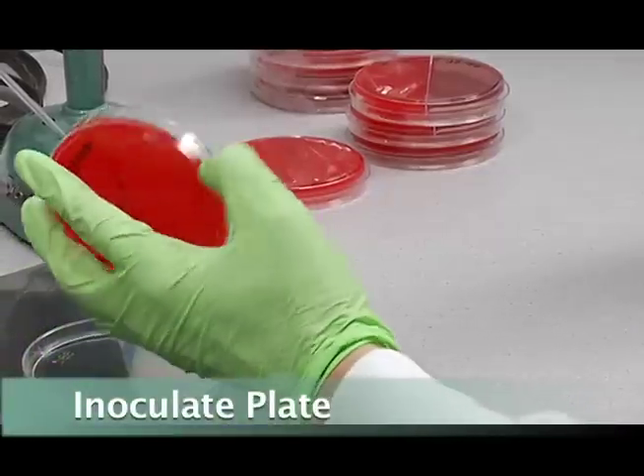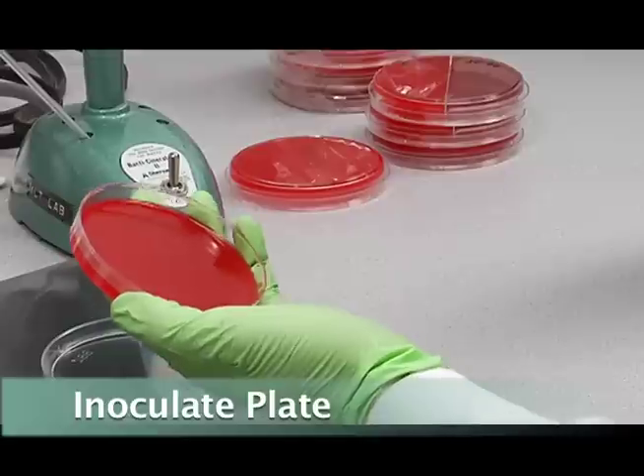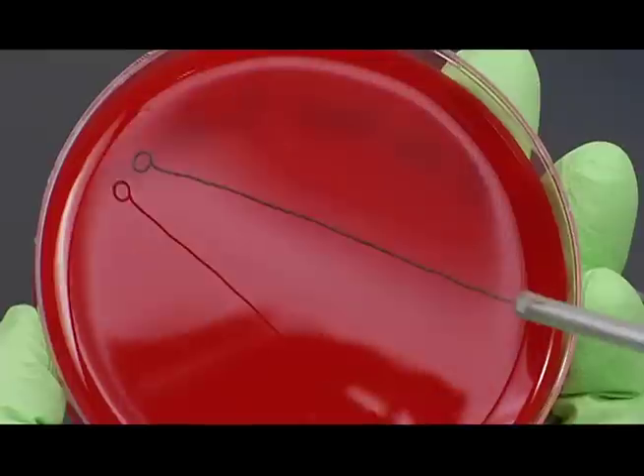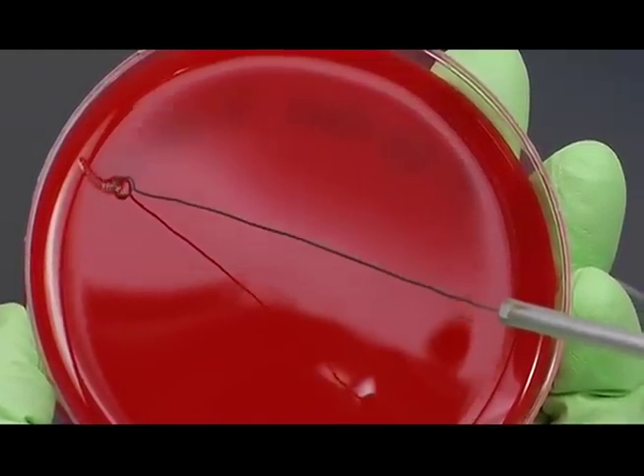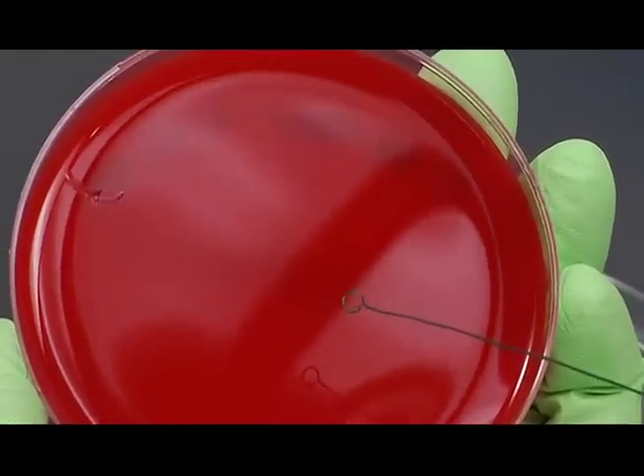Then you can inoculate a corner of your plate. I usually pick a portion of my label so that I can tell where I put my inoculum — right there.